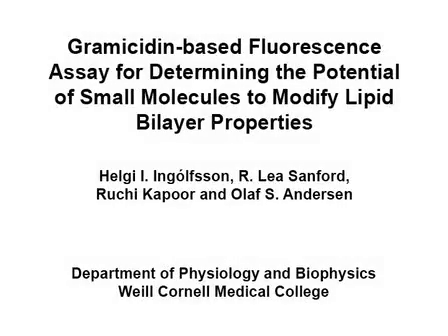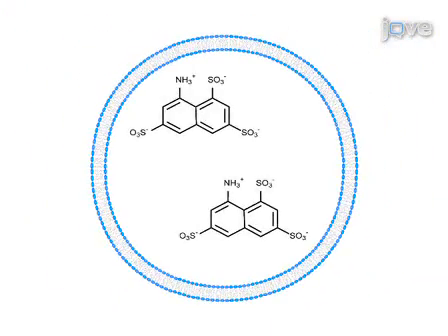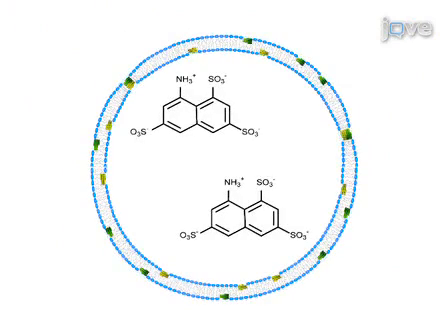The overall goal of this procedure is to measure drug-induced changes in bilayer properties as sensed by bilayer spanning proteins. This is accomplished by first making fluorophore-loaded large unilamellar vesicles. The second step of the procedure is to dope the vesicles with gramicidin.